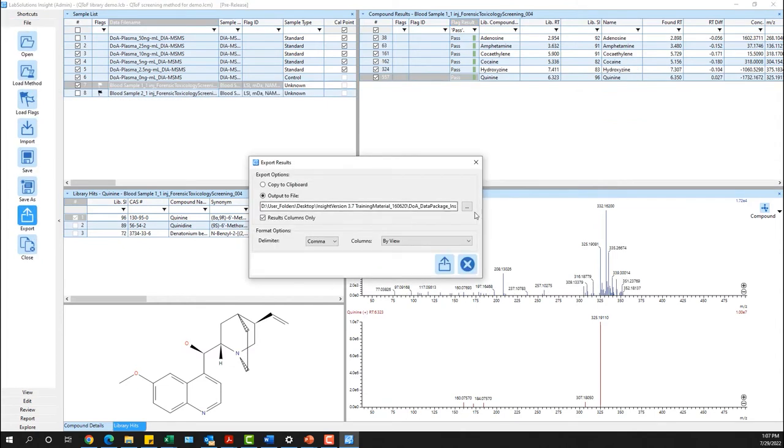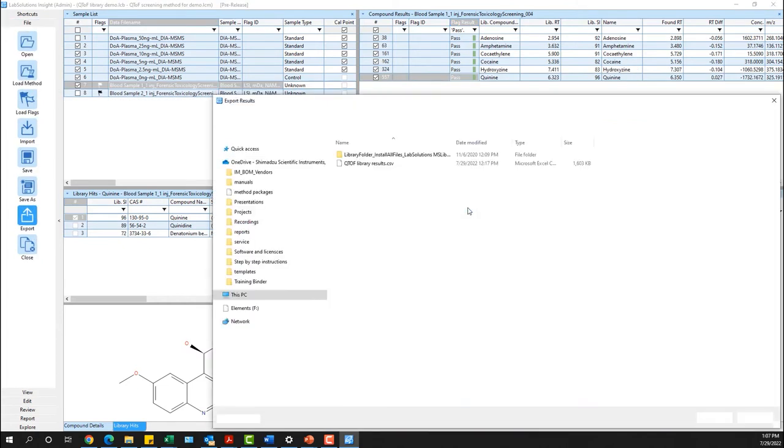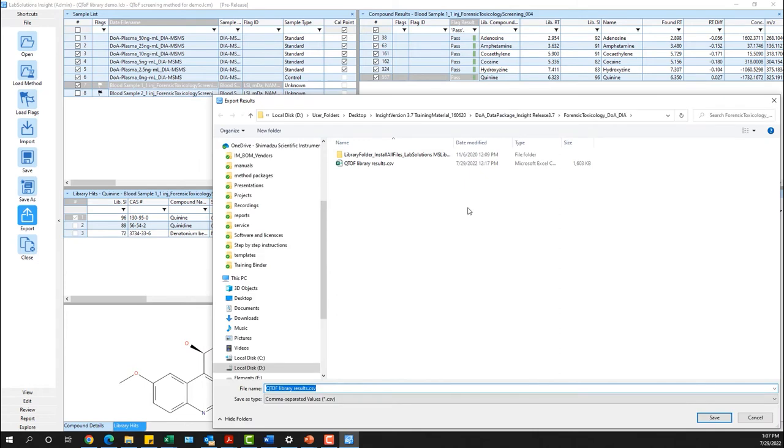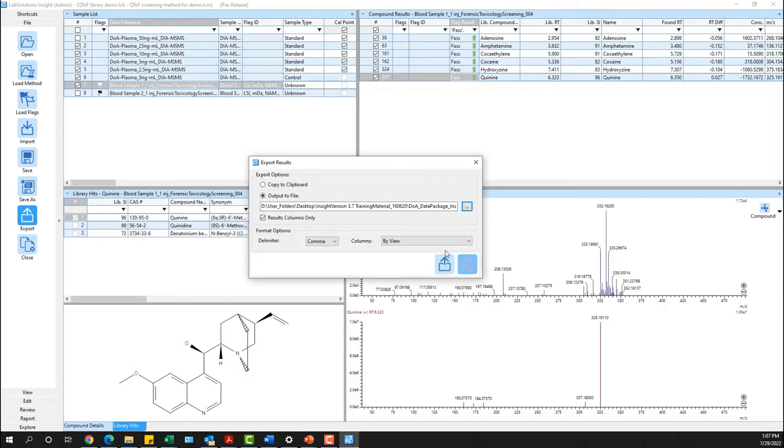Lastly, the results can be reported easily and efficiently using either a pre-configured report template or exported to a specific CSV or TXT file.